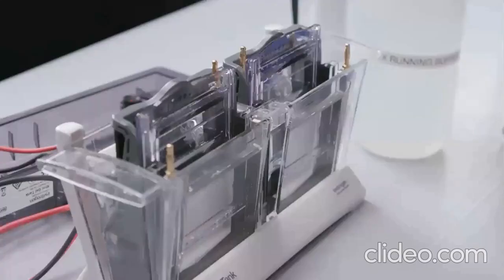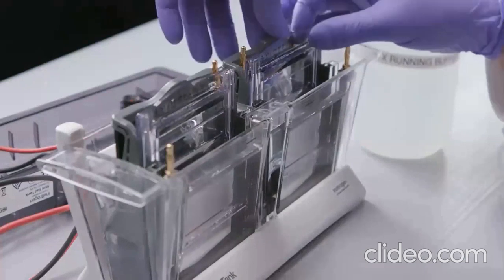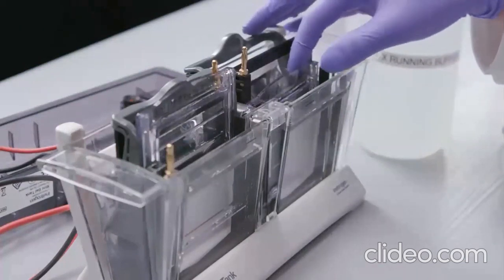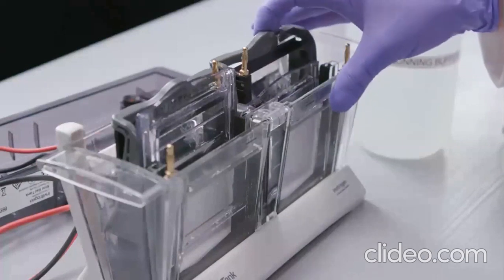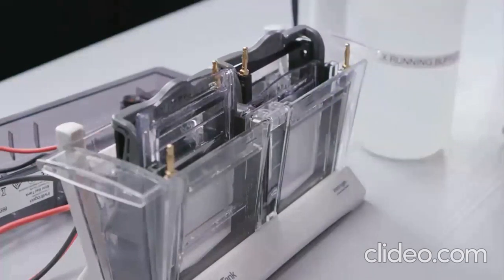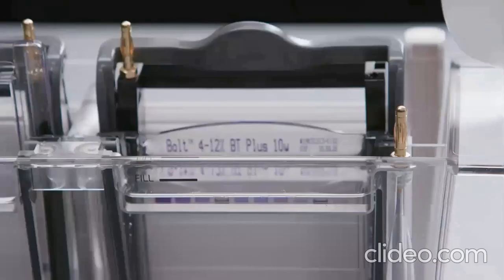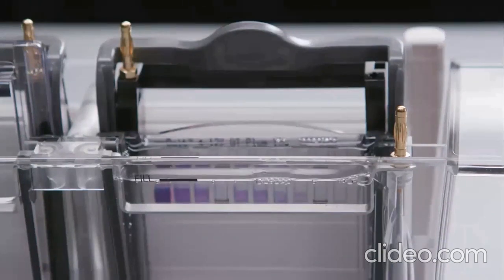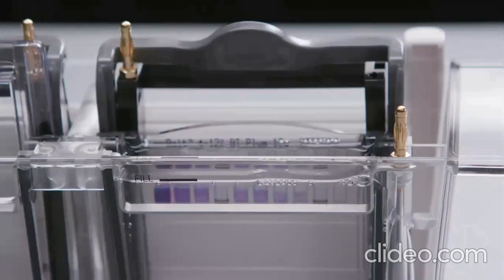After loading the samples and standards, carefully release the cassette clamp while holding the loaded gel. To prevent disturbing the loaded samples and standards, gently slide the gel down so that it rests on the bottom of the tank. Next, pull the cassette clamp forward. With the gel cassette and clamp secured, fill the 2 chambers of the electrophoresis tank with running buffer to the fill line. It is normal for buffer to overflow into outer chambers.